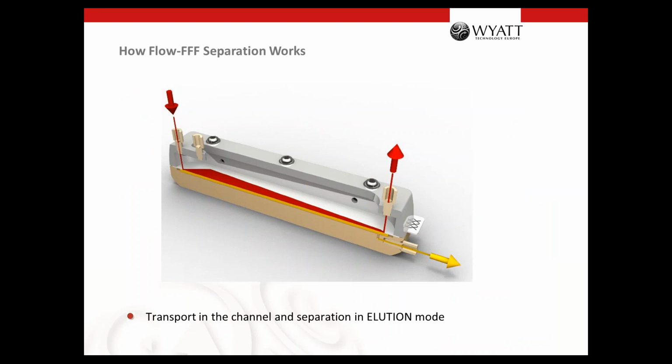So let us go more into detail on the separation. The separation, as I mentioned before, takes place here in this red zone. And the yellow flow here, that is the cross flow. What does that mean? When we pump in the flow here through the main channel inlet, we use one HPLC pump. This pump produces a flow of 4 milliliter per minute.